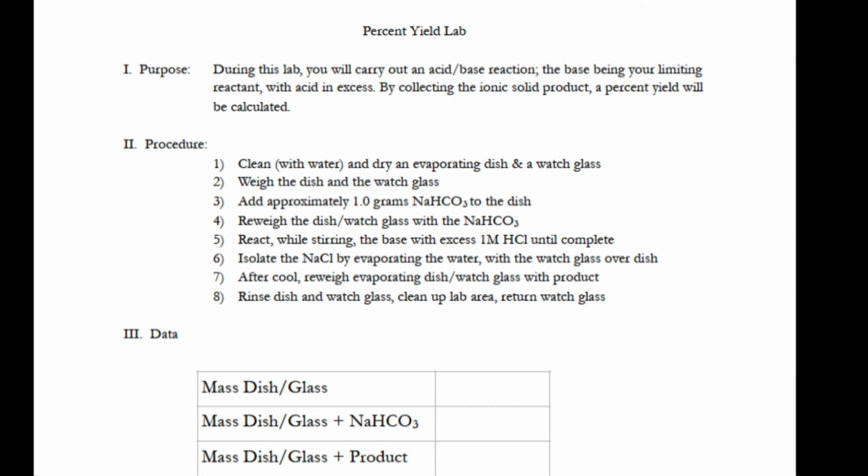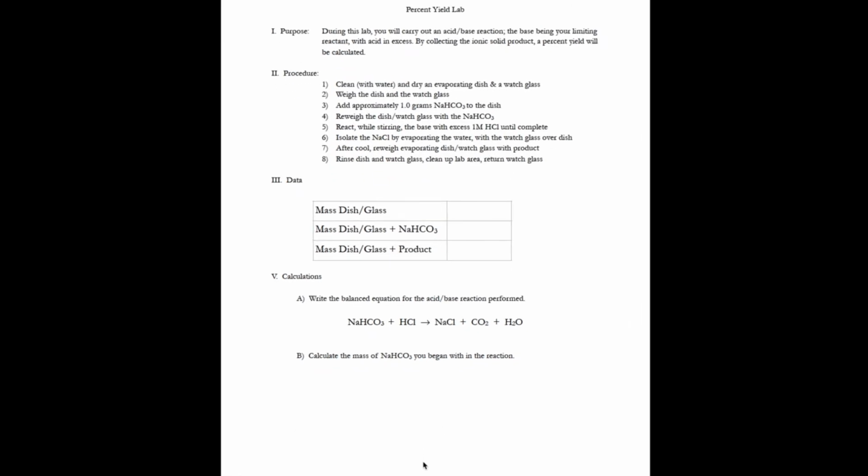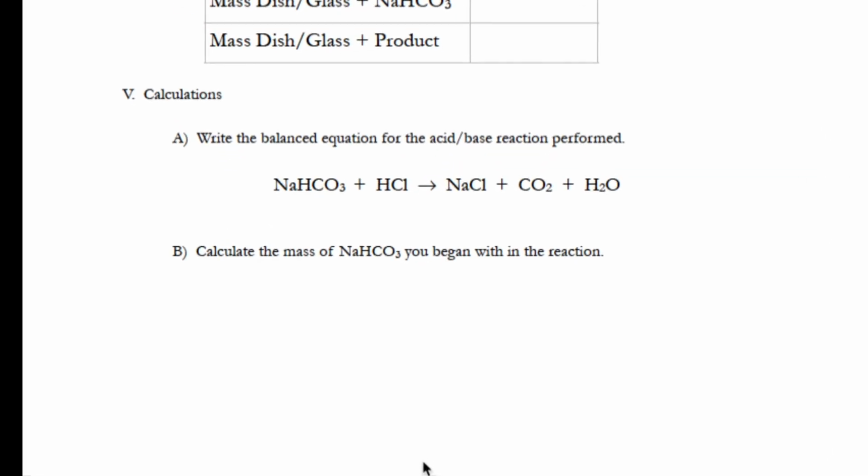Okay, guys, other things that you need clarification on. Okay, let's do this then. Looking at the bottom of the lab, guys, I'm going to say this once, but I am going to give you some guidance. You are going to calculate the mass of the sodium bicarbonate. Yeah, we know it's about a gram, but you're going to figure out exactly what it is. To do that, we are going to do a mass by difference calculation.